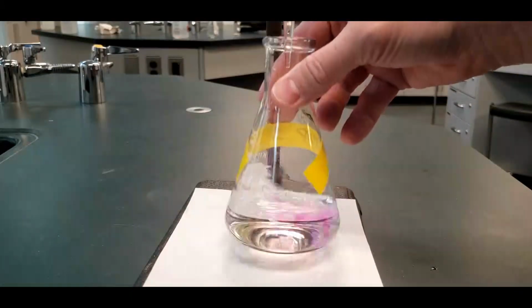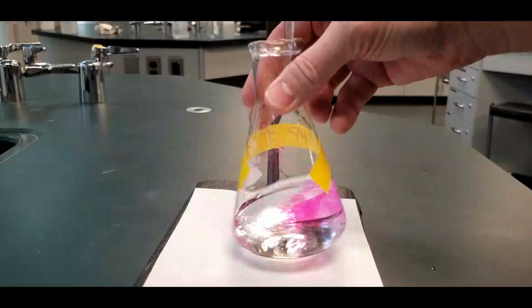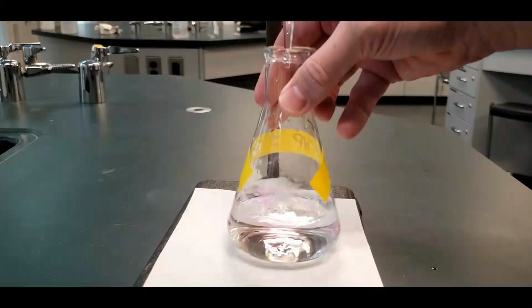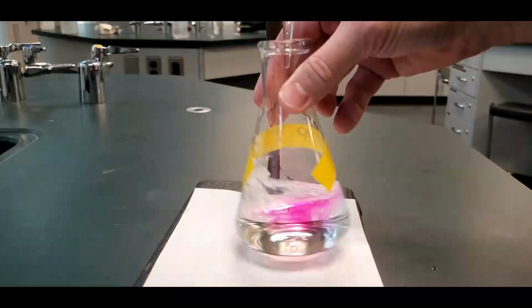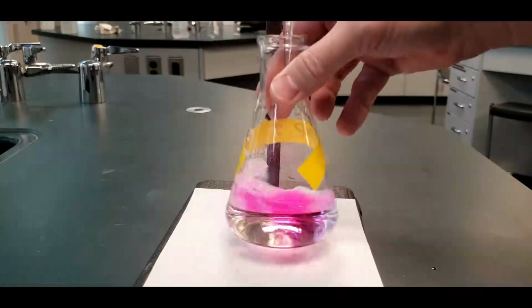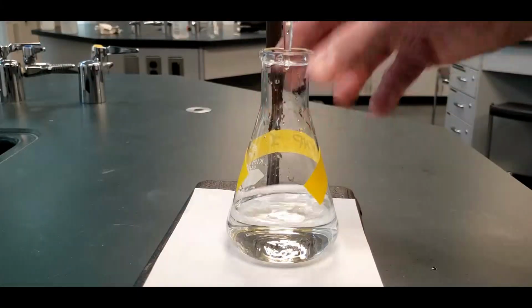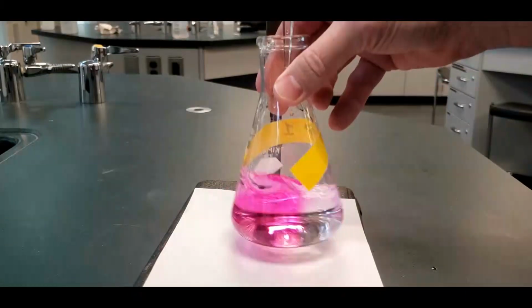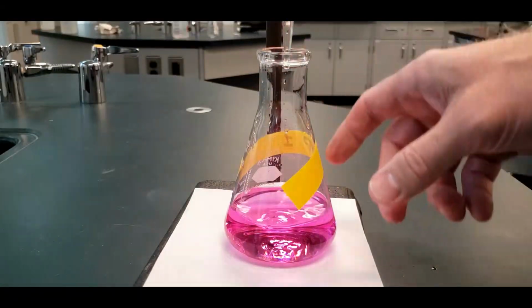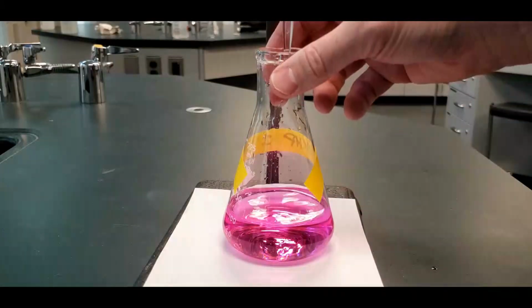This is the titration that we're going to use to standardize the sodium hydroxide. The sulfuric acid was just for practice, just to see how things went. And you do a calculation on it, but this is the really important one because the KHP was dry, so we know exactly what its mass is. We know what its molar mass is, so we also know the number of moles. And it's a 1-to-1 reaction, so if we know the number of moles of KHP in the reaction vessel, we know the moles of NaOH. And if we divide that by the volume of NaOH, we know the exact concentration of the NaOH.